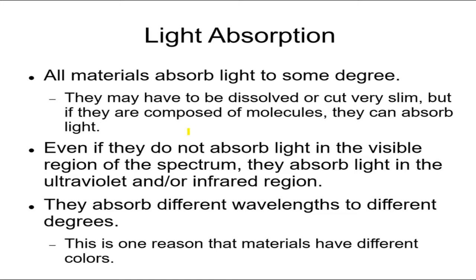The fact is, all matter, all materials, absorb light to a certain extent. Now, you might think a brick is not absorbing anything, and you would probably be right, but if you take a tiny piece of it and you dissolve it, or a really, really tiny, microscopically slim piece of that brick, light will get through it and be absorbed by it. Which technically means that when light hits a brick, the microscopic surface of the brick will absorb a little bit, but by the time it gets past that microscopic depth, nothing is being absorbed. In any event, we're going to assume that everything can absorb light to a certain extent.